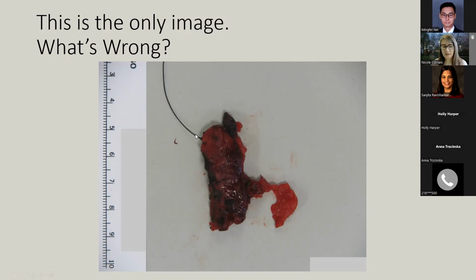Thank you. So, I think there is orientation. There's a suture on one end. So you could say this is the suture at the superior pole or the inferior pole or whatever. So actually this is good for orientation because it shows you the lay of the land of the specimen. But as mentioned, there is no cut section of tumor, right?